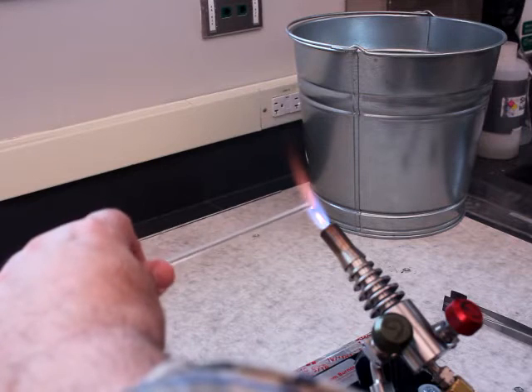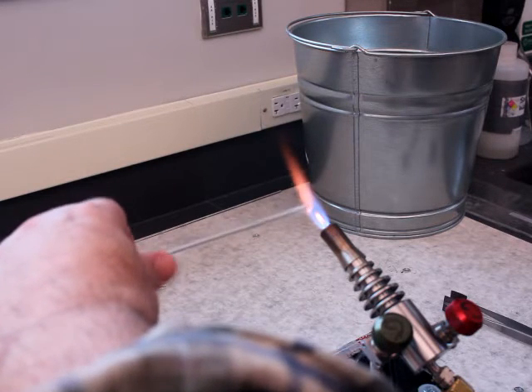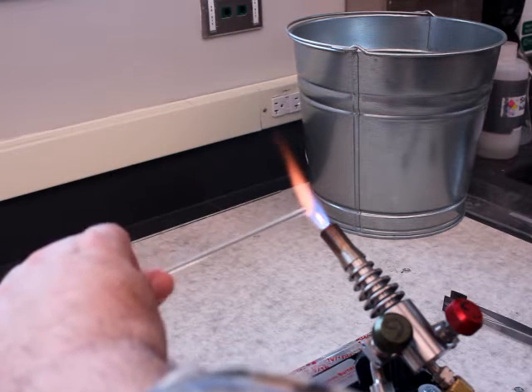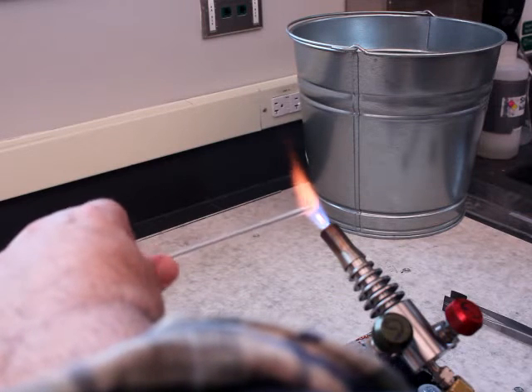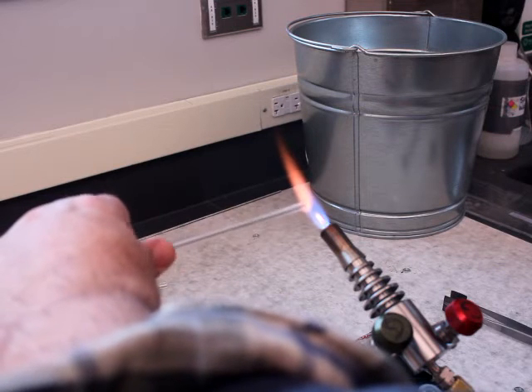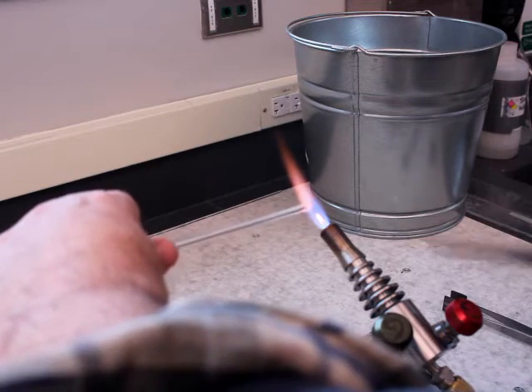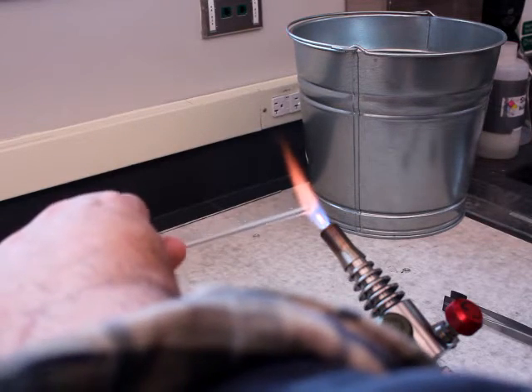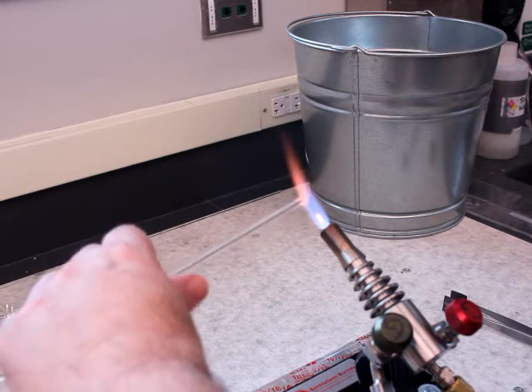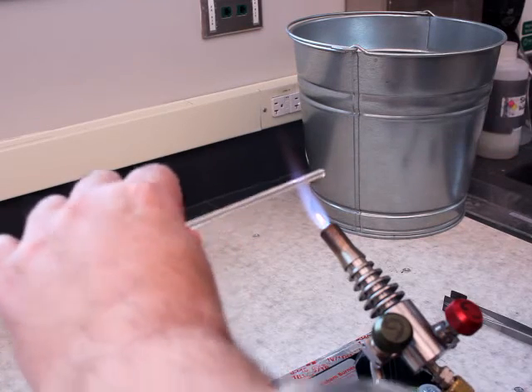What I'm doing now is fire polishing some rod that was cut by either myself or some students using a file or a glass cutter. First, we heat the very edge of the glass rod a couple millimeters or thereabouts. I'm doing this at a little bit of a weird angle just for the camera, so you can see I've got a very nice looking edge.